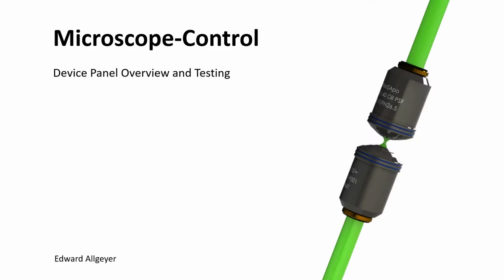Welcome back. Now you've tested all your device connections with the vendor supplied software and everything is working fine. You've set up your configuration file, so it's time to actually try and connect with each device and make sure LabVIEW is talking with them as expected. The best way to do this is using a microscope module called the device panel.